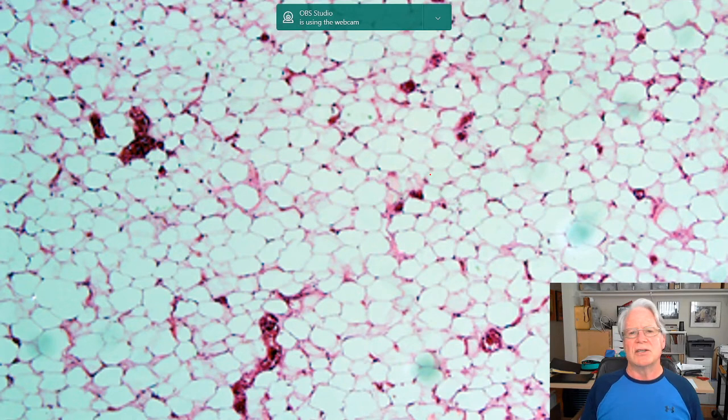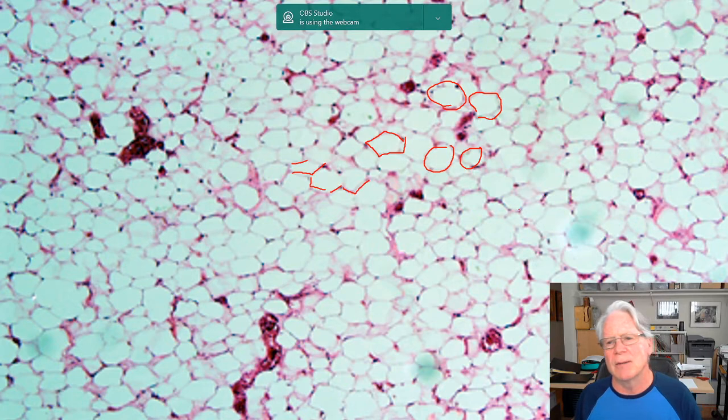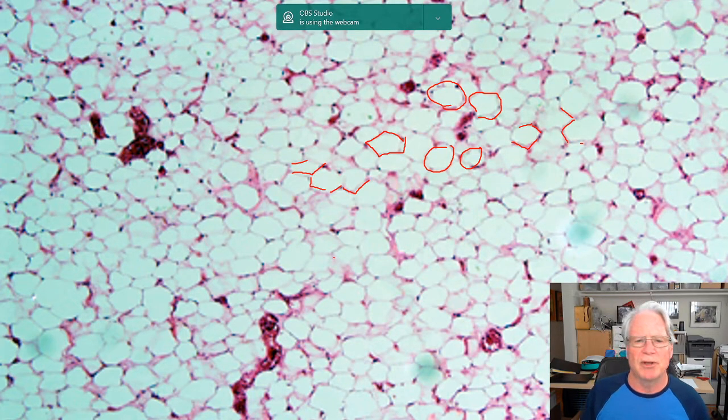So here it is. This is a low magnification. We can see the cells right here. We can see they're all closely packed together. Notice the kind of irregular shape of these cells, they're not round. Some of them are approaching round, but most of them have this kind of flat surface when they're in contact with their neighboring cells. Here, flat, flat, flat. So this is a very quick diagnostic characteristic you can use. You can see a lot of cells with these flat surfaces as they come into contact with their neighbors. They kind of flatten out, and they're not these perfectly round cells.